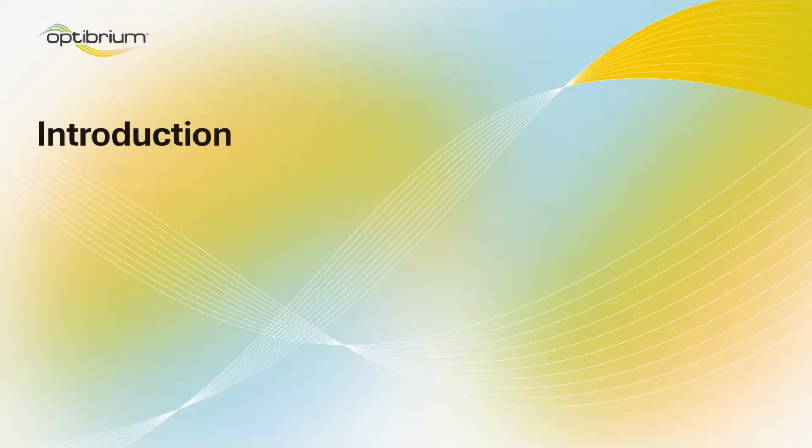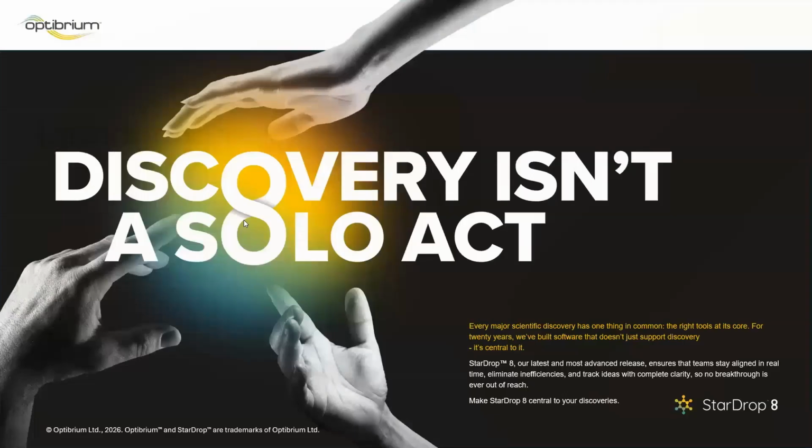We knew it was important to maintain this level of flexibility that StarDrop users have always appreciated. So we needed to create something a little bit more complex than a shared document. And you can probably imagine my colleagues in the development team weren't overjoyed as I laid out my list of requirements. Let me show you what we've done. It's my pleasure to introduce StarDrop 8.